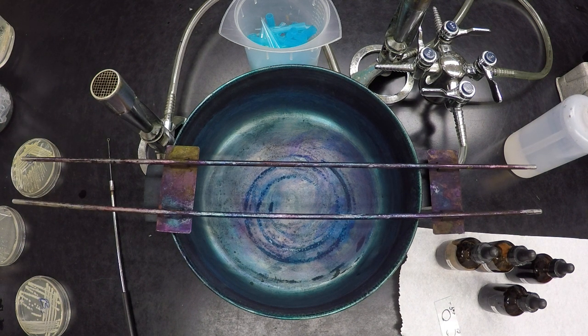Gram stain is a differential stain, and we call it that because we use multiple dyes to be able to differentiate between different bacteria based on their cell structures. In this case, the gram stain is able to stain the different bacteria based on how their cell walls are put together. The gram positives retain dye, the gram negatives do not.